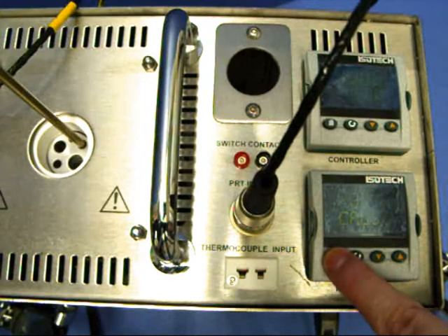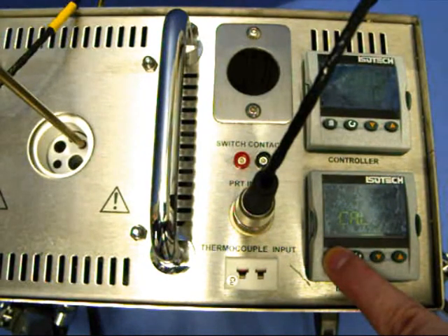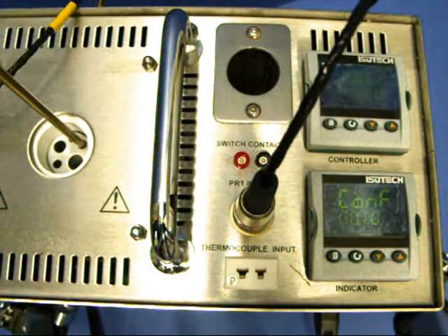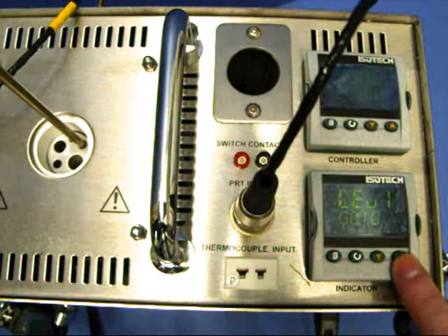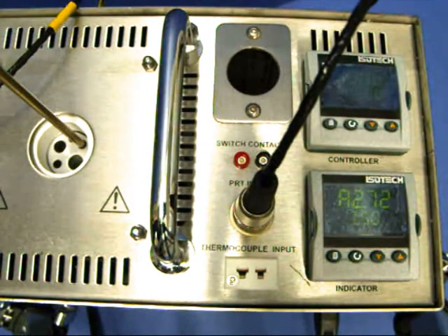To exit this mode hold the page key until the top display shows CONF GO TO. Then set the upper display to level 1 using the up key. While in this mode take care not to modify any other parameters.